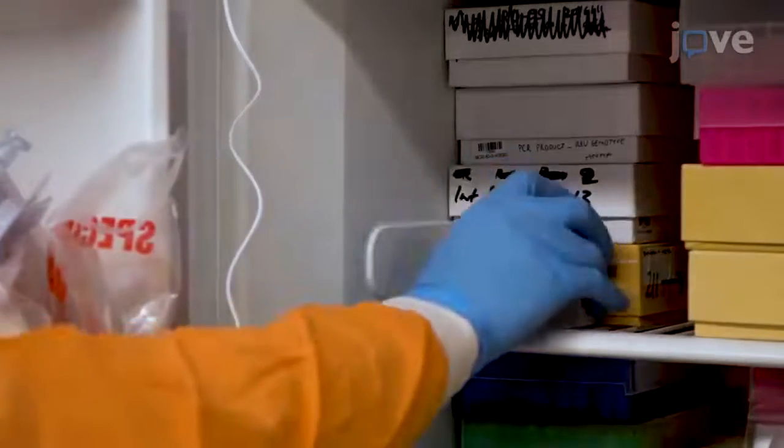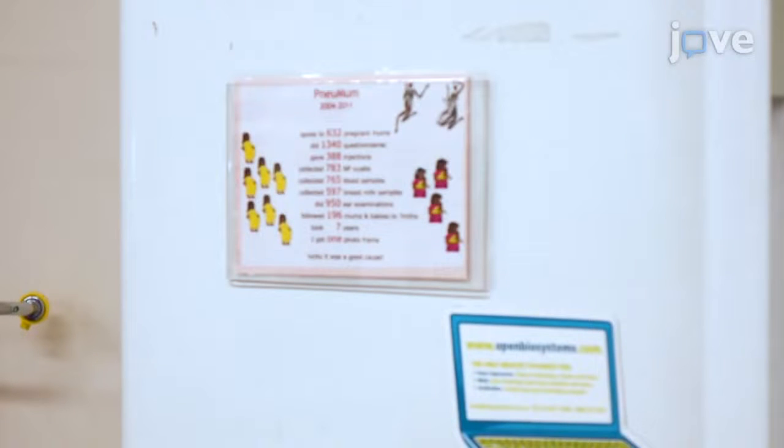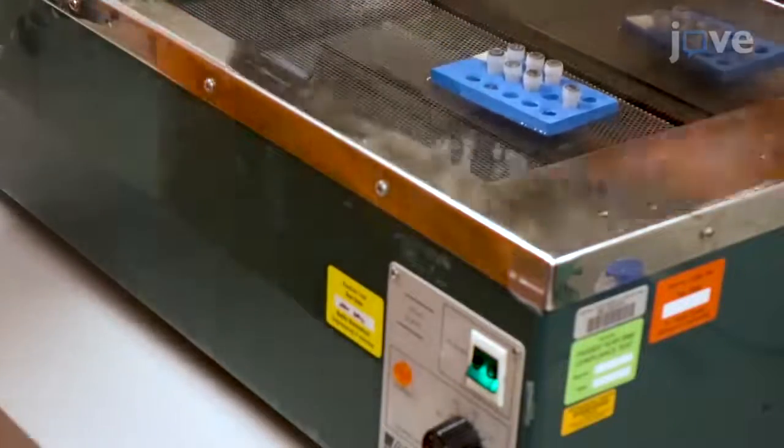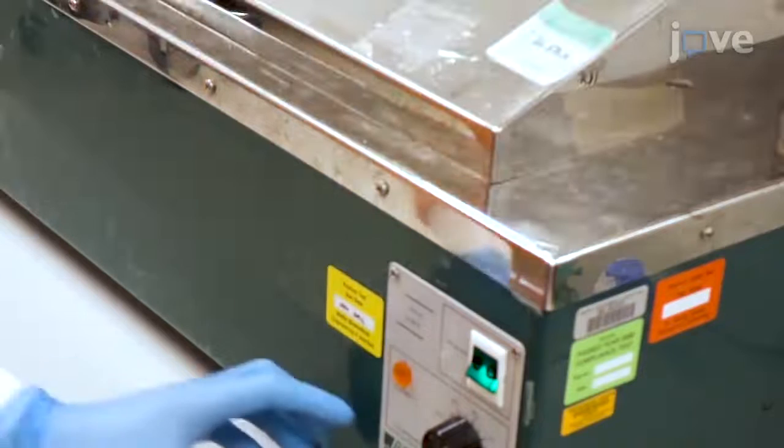To prepare the serum dilution on day two, first thaw the human RSV reference serum and serum test samples at room temperature. Then place them in a water bath at 56 degrees Celsius for 30 minutes to heat inactivate them.